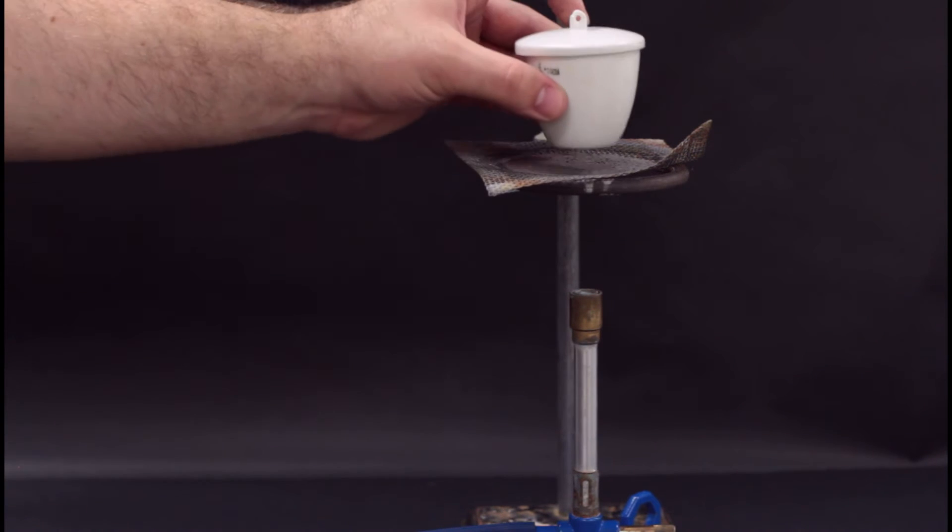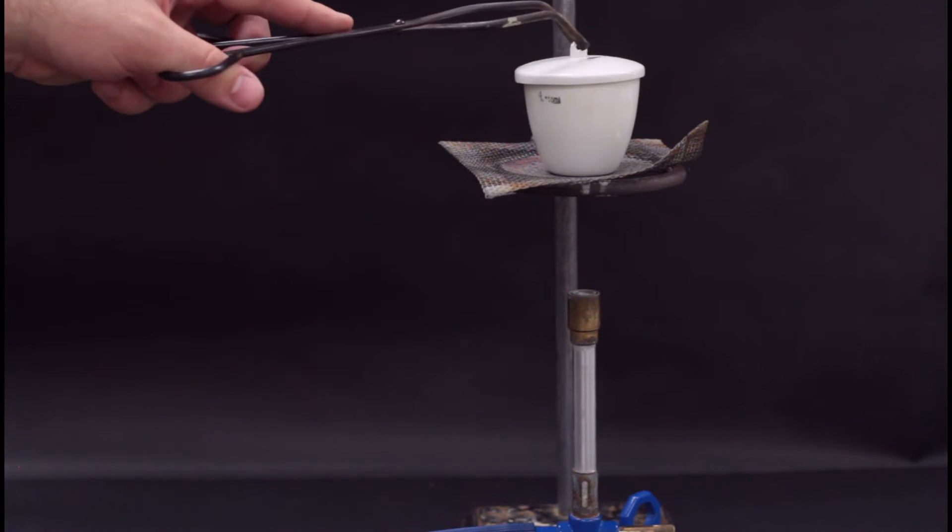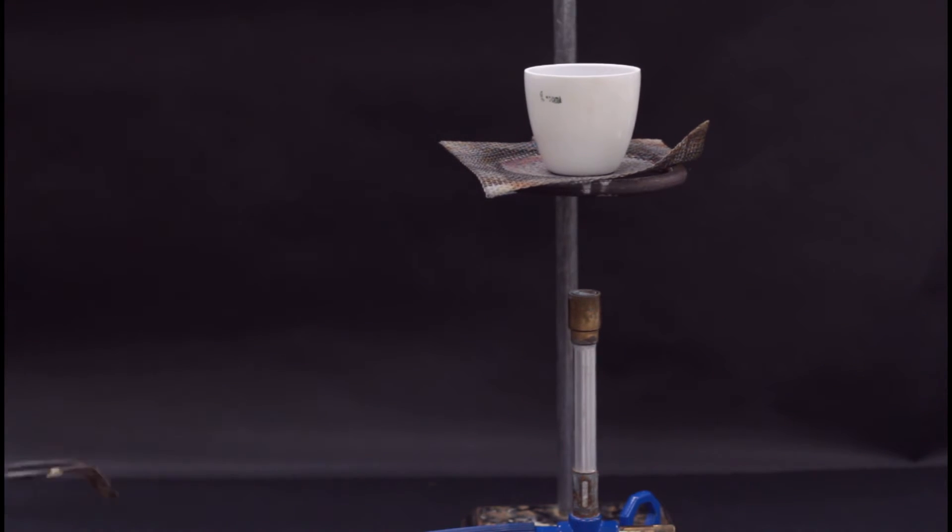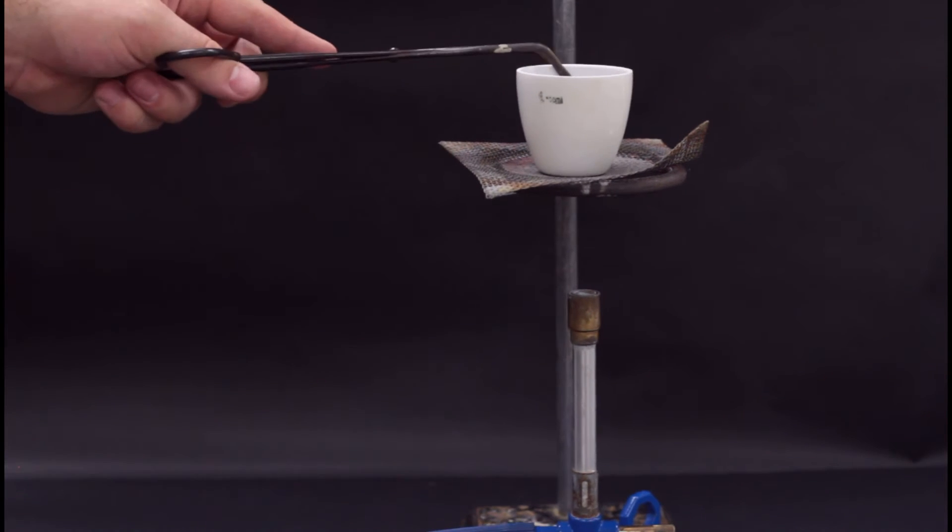Set up the ring stand and the Bunsen burner and place the crucible on the ceramic. Practice using the tongs to remove the lid and move the crucible around, because once we start you won't be able to touch it directly because it'll be really hot.